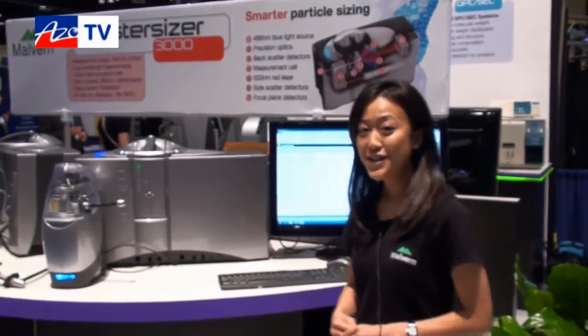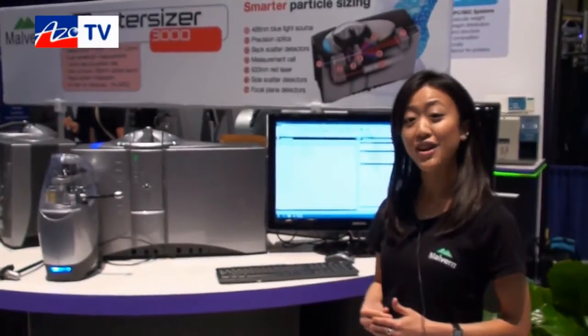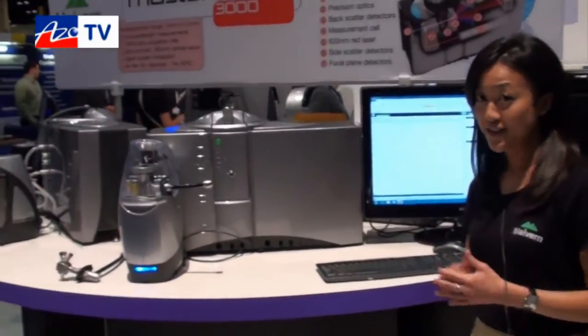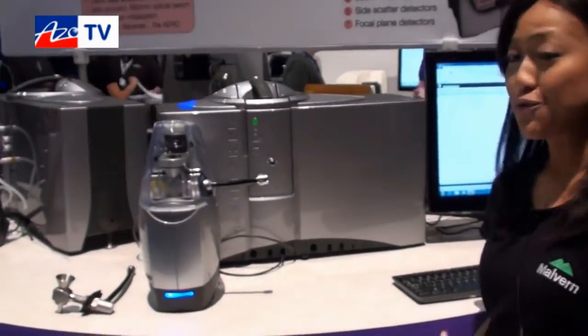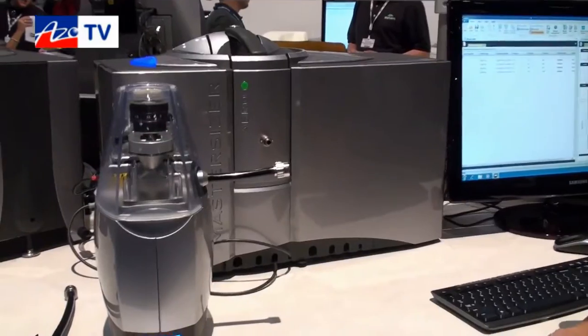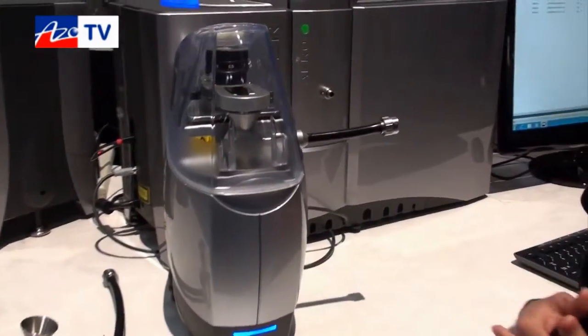Thanks, Cameron. This year at PitCon we are introducing our brand new MasterSizer 3000, a laser diffraction particle size analyzer. You may already be familiar with the 2000, so what I'll be doing today is briefly introducing what's new and different, starting with our dry powder dispersion unit called the Aero S.